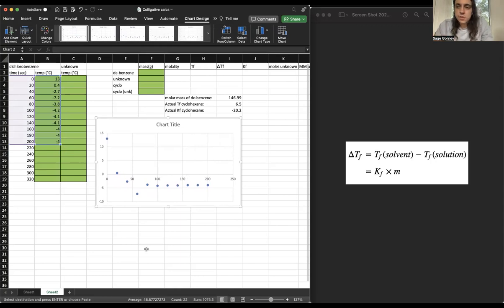Okay. The first thing I want you to notice here, in our pre-lab lecture, I pointed out what kind of lines we're going to be using to calculate our freezing temperature for this cooling curve. In reality, our temperature is going to be somewhere over here, some point that we never explicitly measured during our experimentation.